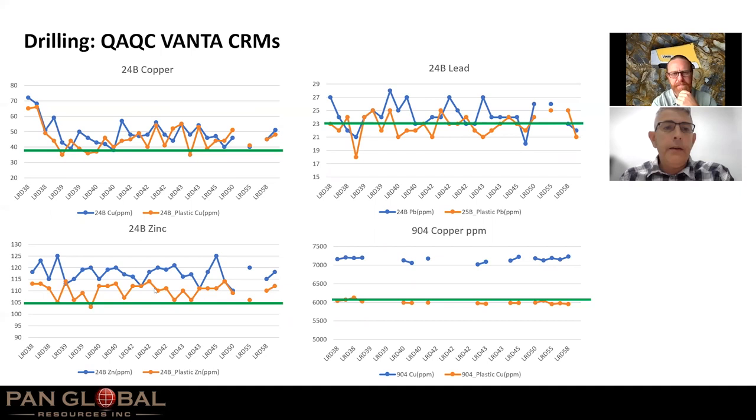We could spend time fitting to the line, but we don't think it's worth it. What we do is we will do an analysis of the puck, and then we will put same material from the sample bag between it, and then we compare the two data. I'm really just looking for a straight line. I'm not looking for too much variation. At both levels you can see the effect of the attenuation of the bag, which is often linear. But the data's clean. I'm happy to accept the data that the Vant has given us.